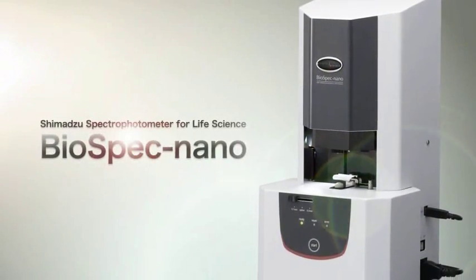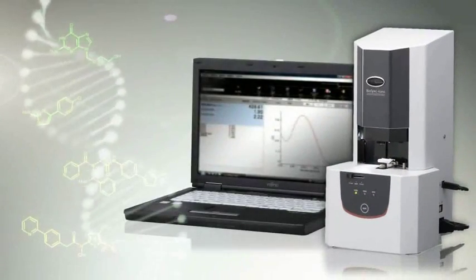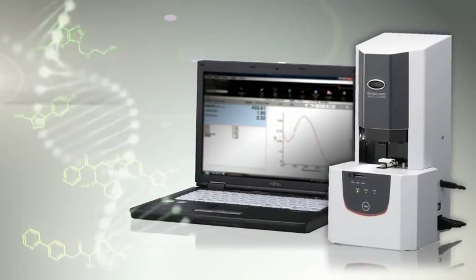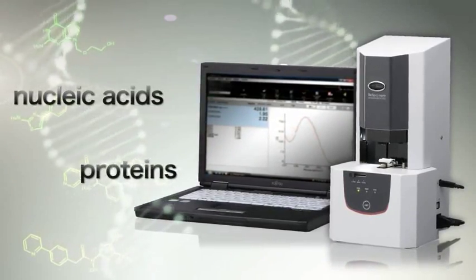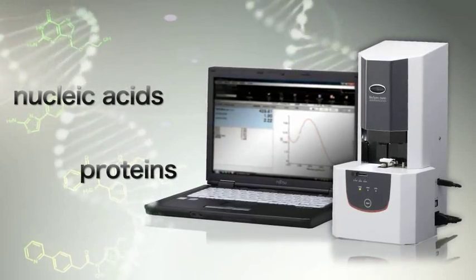SHIMAZU SPECTROPHOTOMETER FOR LIFE SCIENCE BIO-SPEC NANO. The BIO-SPEC NANO is a spectrophotometer suitable for quantification of nucleic acids and proteins, as well as for general photometric determinations of other analytes.